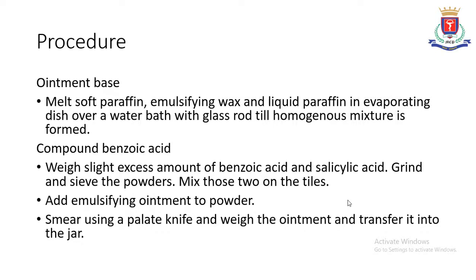So what is this levigation process? You smear using a palette knife, which we also call a spatula, and allow the powder to get properly incorporated into the ointment base. Care has to be taken that the particles should not be visible to the naked eye. So the levigation process has to be carried out until complete disappearance of particles takes place. Disappearance of particles indicates that the particles have been completely incorporated into the ointment base. Once your ointment is ready, you can transfer it into a wide mouth container.